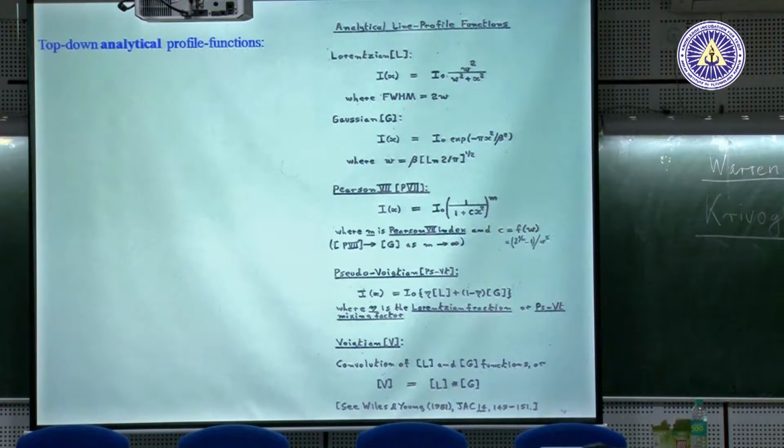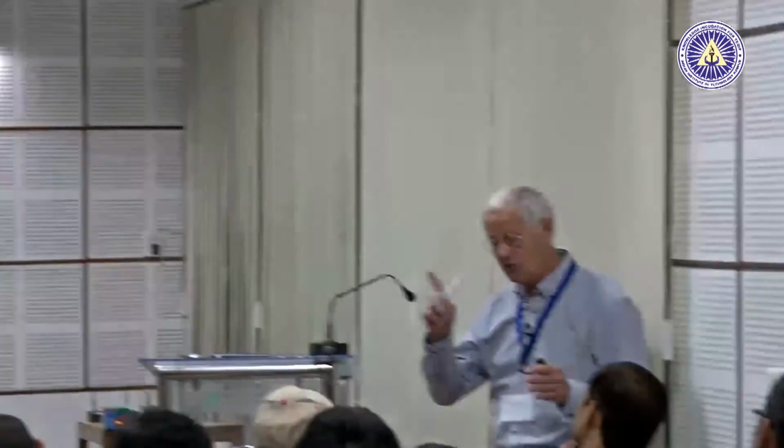Please try to remember that Rietveld, the Rietveld method, is a great procedure to refine the crystal structure. It is a structure refinement method. Structure refinement. You are tuning the atomic position in the unit cell until your calculated and measured pattern fit each other. This is the quintessence of the idea of Rietveld.